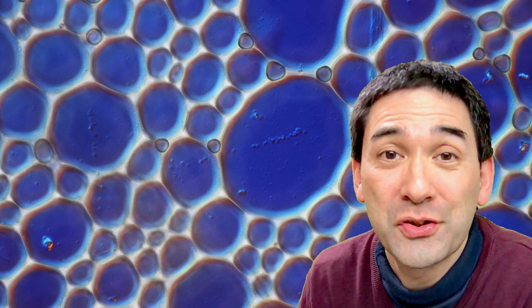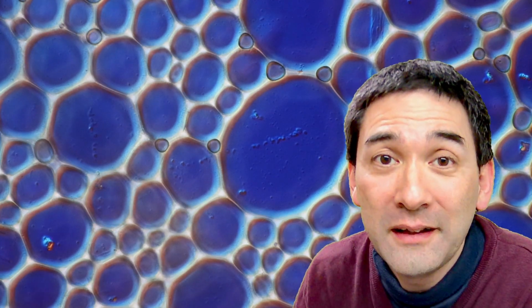Yeah, so I go up with the magnification. I think they look kind of pretty. Yeah, they look pretty nice, and I have to hurry up because the foam bubbles start to pop and they start to fuse together. And here I'm now superimposing the micrometer slide with the foam bubbles, and I assumed that a foam bubble has approximately a diameter of 0.05 millimeters, so pretty small.